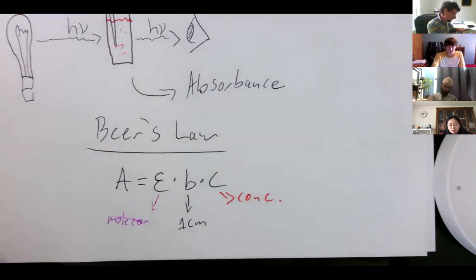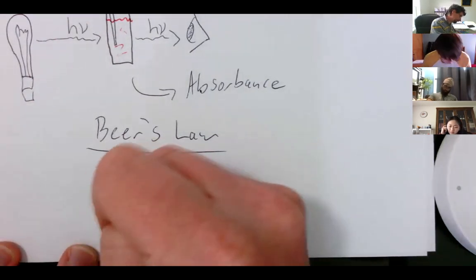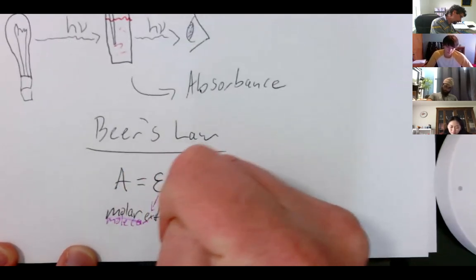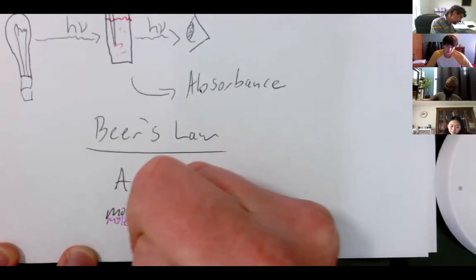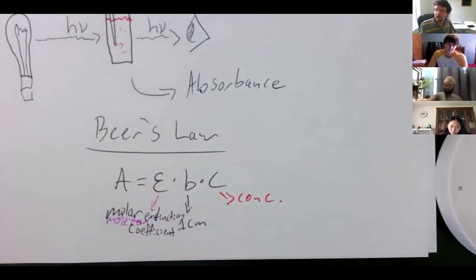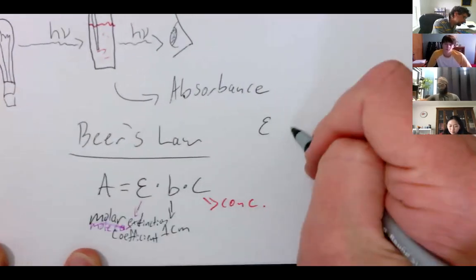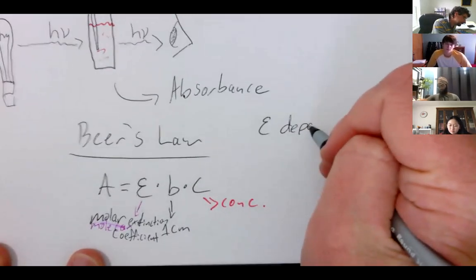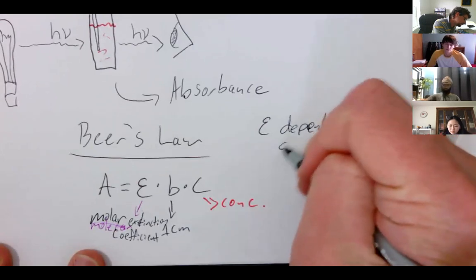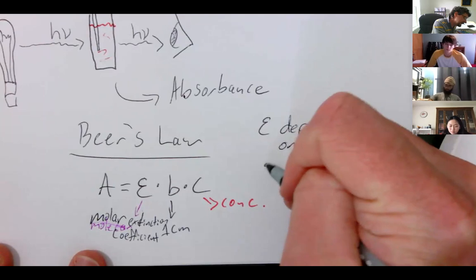Molar extinction coefficient. And that depends on a couple things. So what things does epsilon depend on?